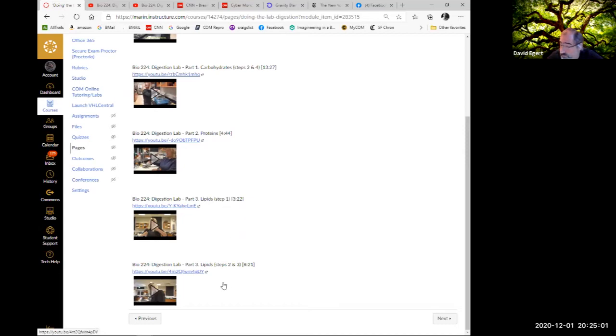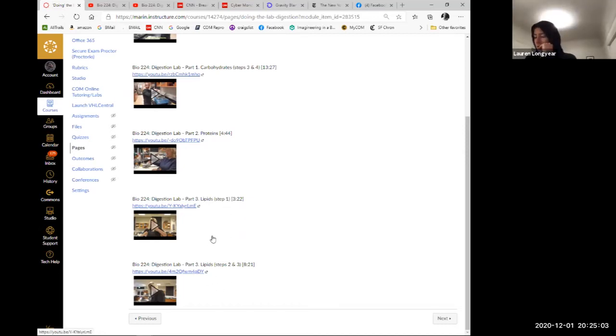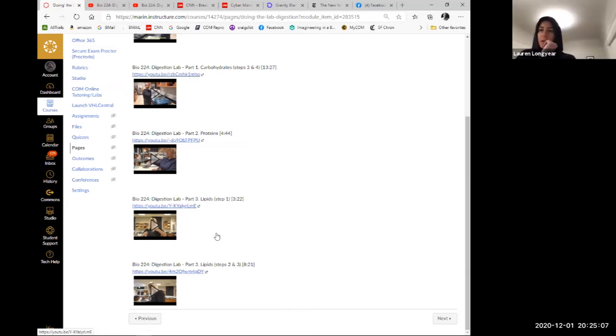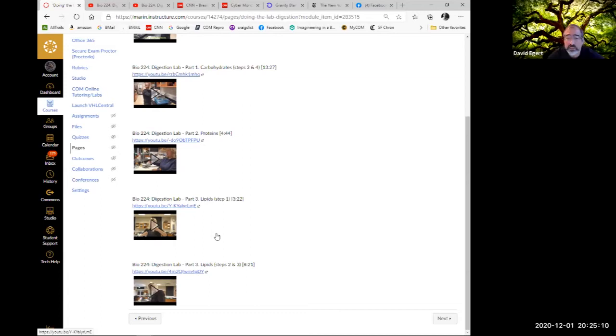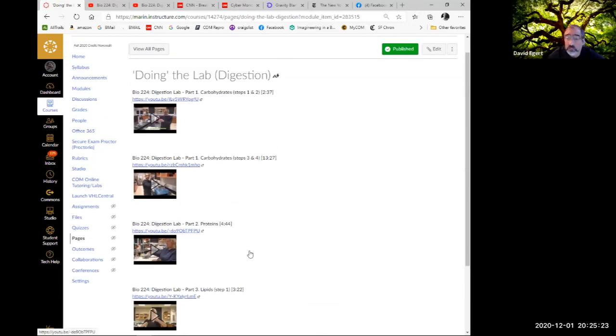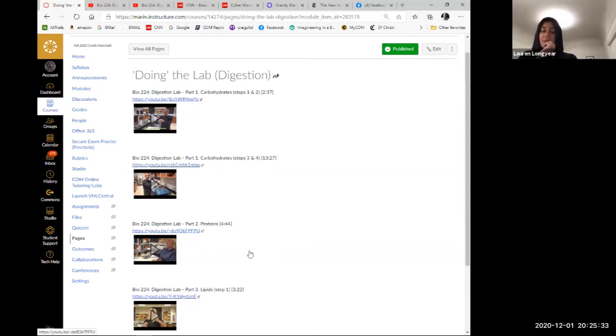I have a question about test tube 3. I don't understand why it appeared cloudier than the other ones. What do you mean cloudier? Well, they said to make an observation about how 3 looks different than 1. It's because HCl was added earlier, but it appears cloudier. Well, 1 compared to 3: 1 has just water, and 3 has spit in it, which has the mucins, the saliva. Oh, gotcha.